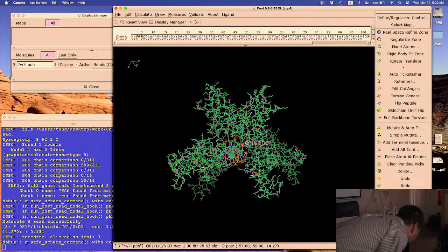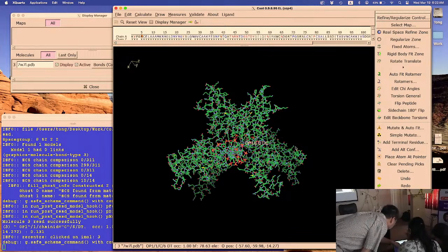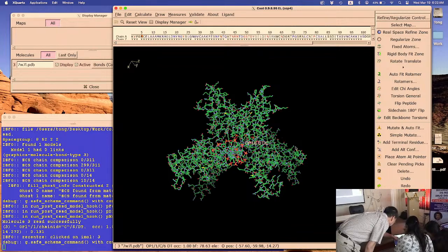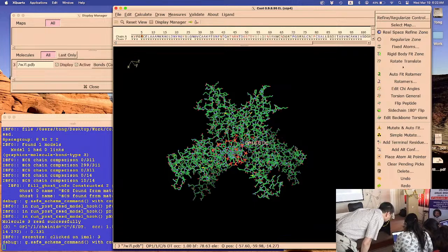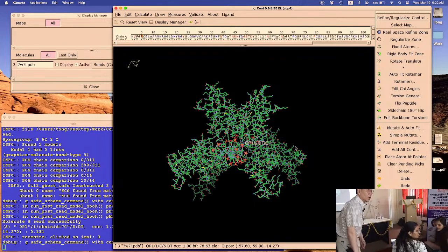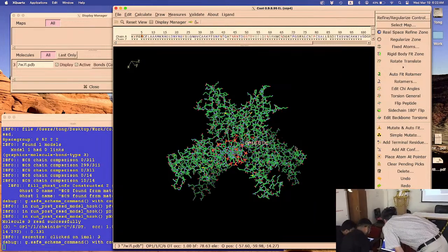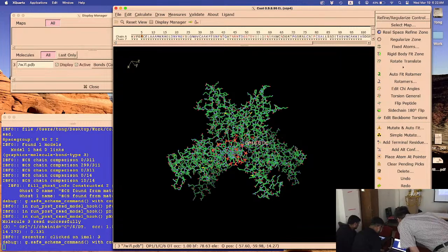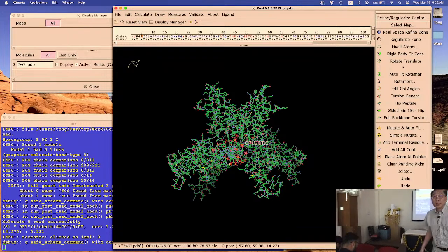Where? In COOT, let me see. Is it the COOT folder? Not bin Coot. The COOT folder that came from Professor Shukla yesterday. Okay. Yes. In that directory. Did you find it? Yeah, open it. This one. Yeah. PDB. Yeah, zoom out.